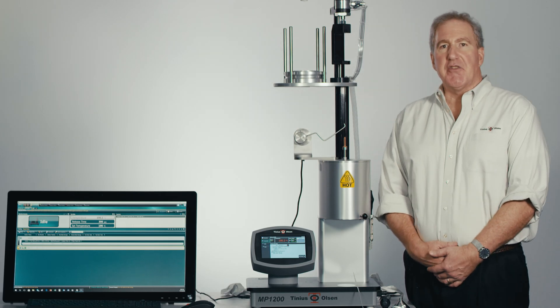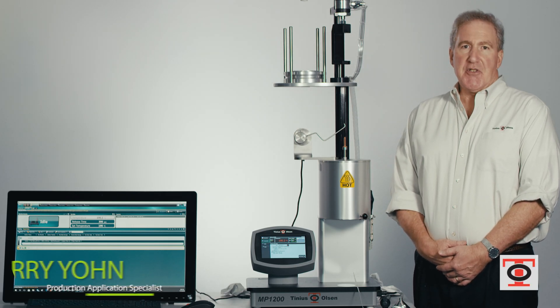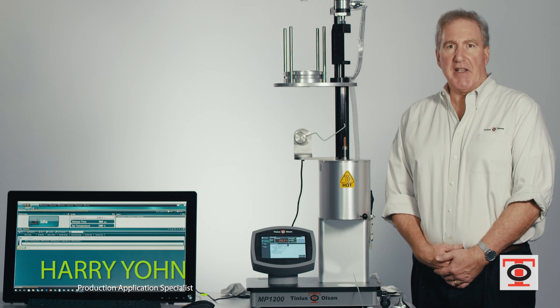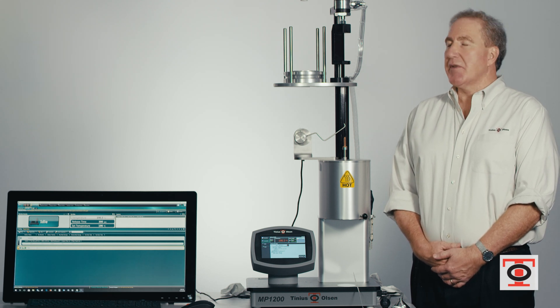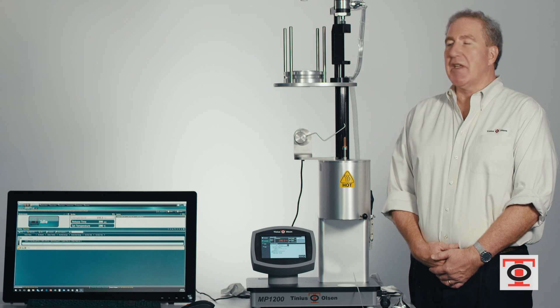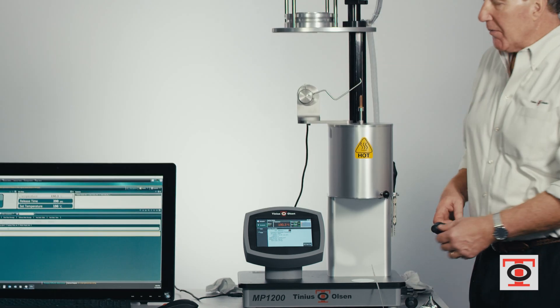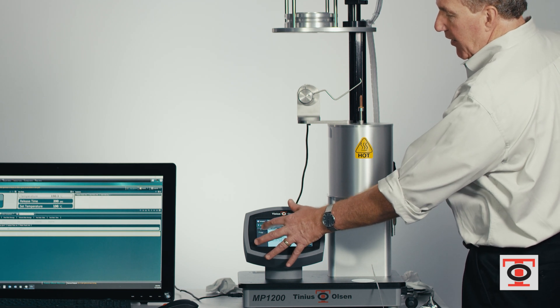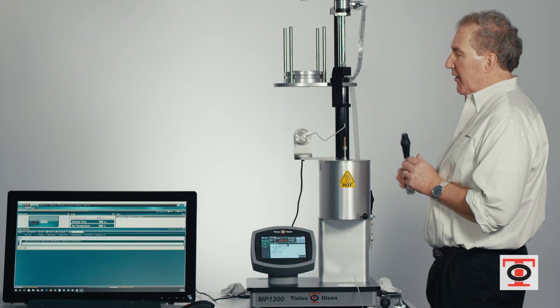After each test, it's imperative that you clean the machine thoroughly to get rid of all residue that remains so it doesn't affect the next test. This particular setup will show how the cleaning function works. You simply go onto the control panel, go to the accessories, and press on the clean button.